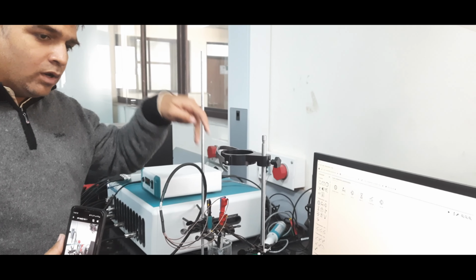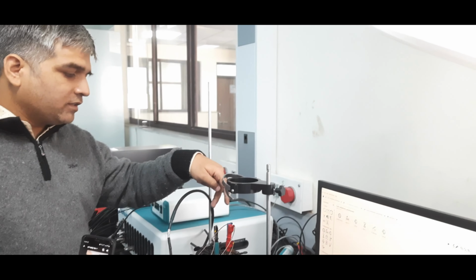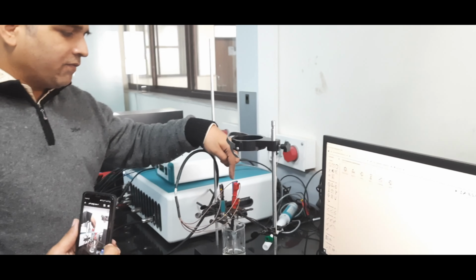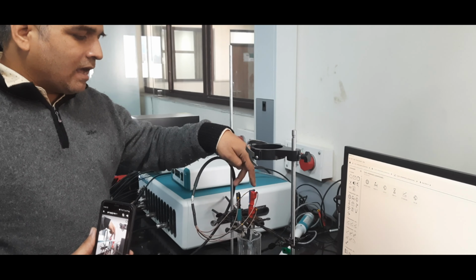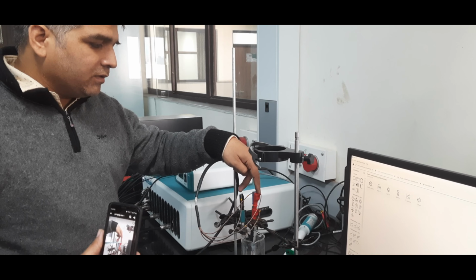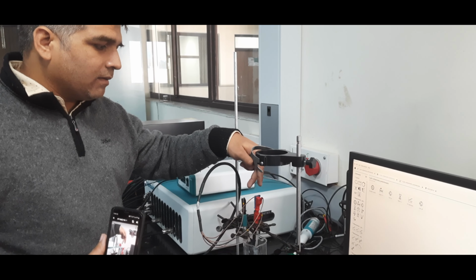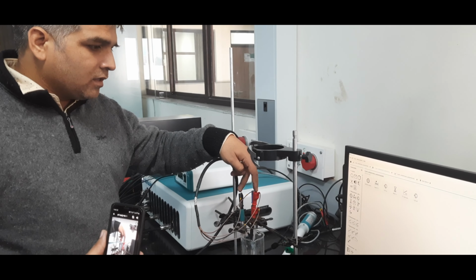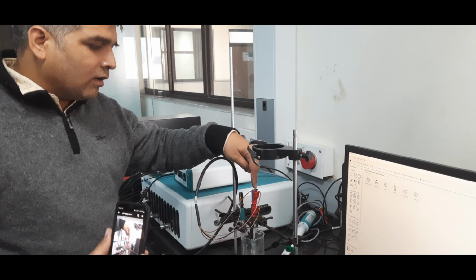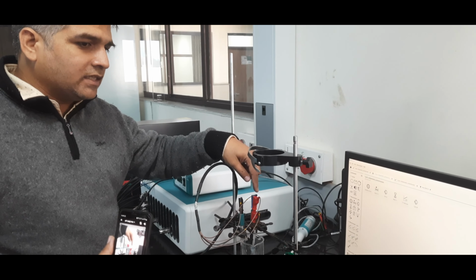We can have a 2 electrode system also. In 2 electrode system, we don't have this reference sort of thing. We have only these 2 electrodes, and we can apply a bias between these two, and whatever changes will come, that will come between these 2 electrodes. We cannot say that on this particular electrode something is happening.